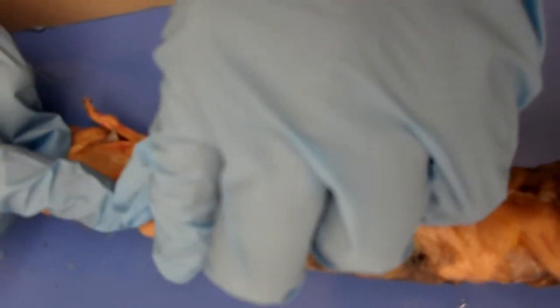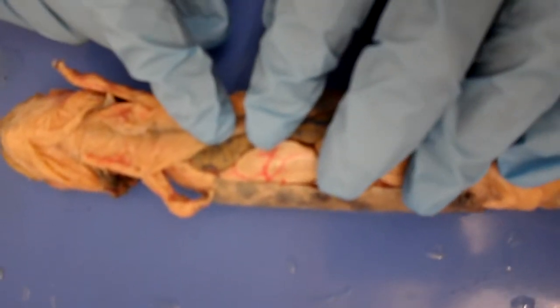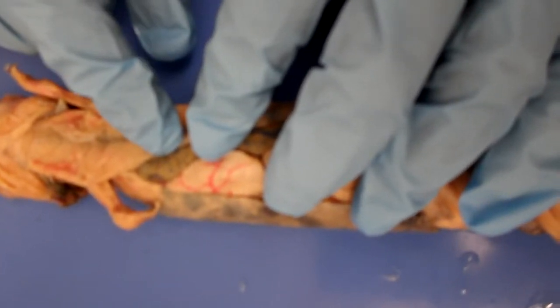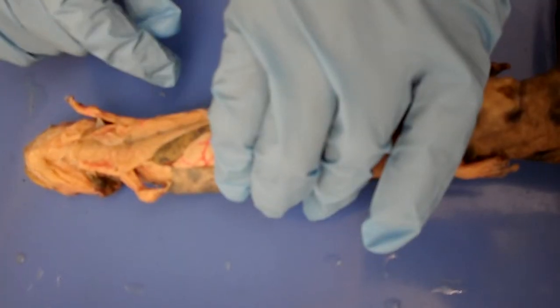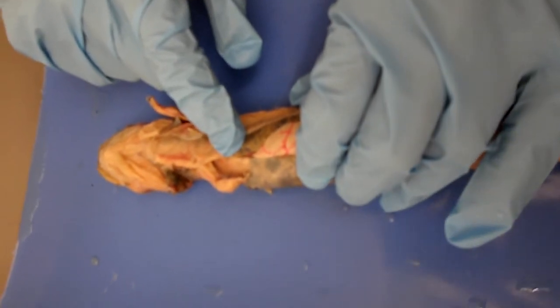Down here we have the rectus abdominis, and this originates at the... it is homologous to the... the rectus abdominis is homologous to the hypaxial muscles of the shark.